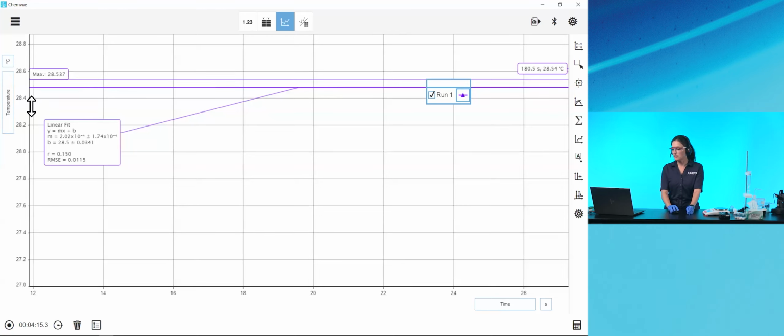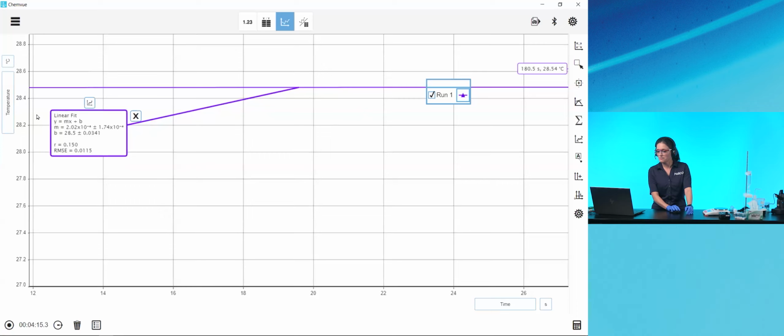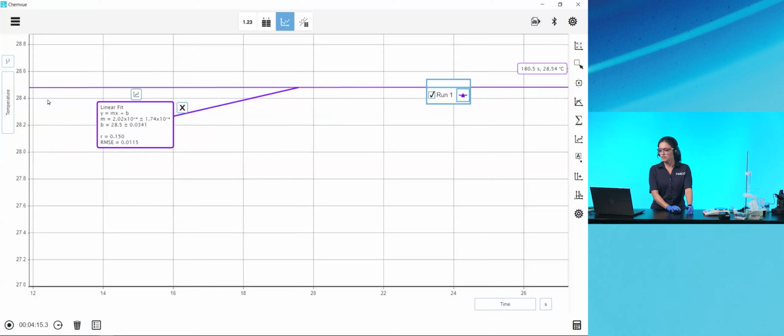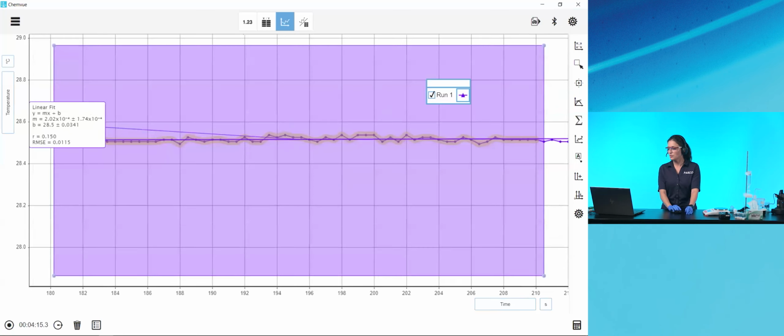That's actually a little bit lower. Oh, you know what I think I'm doing is I have the max tool on there. There, now I can see it better. So there's my linear fit. So the maximum is telling me it really should be closer to this value here than what I saw in the data. So that's one way to estimate the true high temperature.